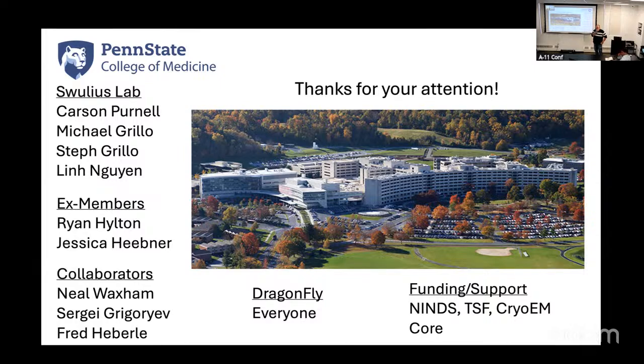How does the denoise interact with your segmentation? Yeah, I was trying to say that earlier. It can be beautiful. Sometimes I have tried training a model that has both noisy data and idealized, sort of non-noisy data as well. So the network can segment noisy and denoised data, and under those circumstances, it works pretty reliably.